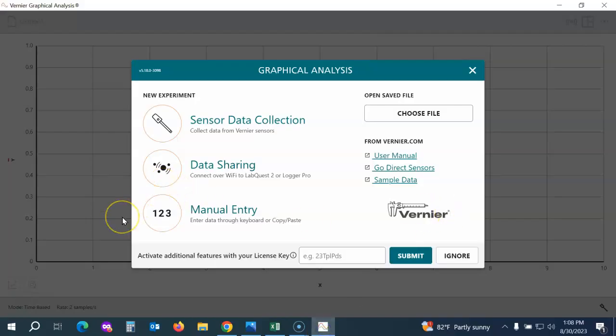For the purpose of this video, I'm going to use the installed desktop app, but everything looks exactly the same whether you're using the desktop app or the web app. When you launch Vernier Graphical Analysis, you'll see this option.